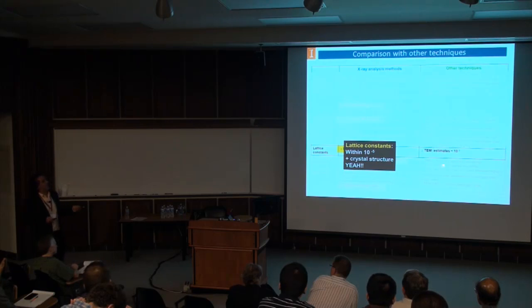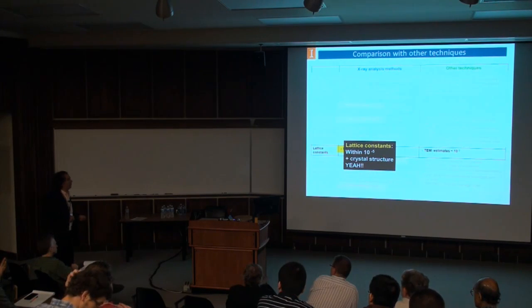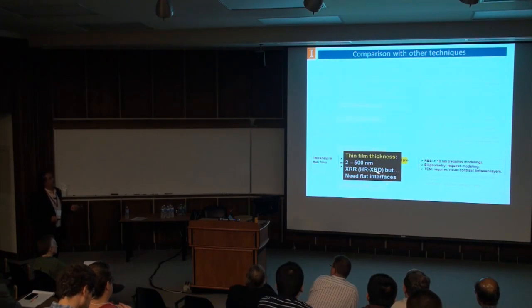So this is where we are. TEM, for example, can do 10 to the minus 3. Other techniques, they just don't do it. How about thin film thickness? X-ray can do like 2 to 500.